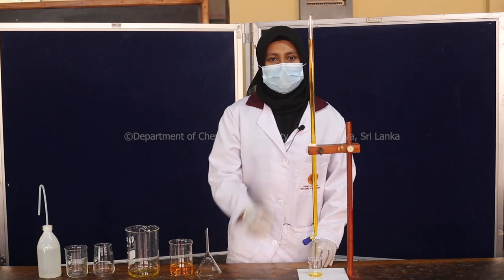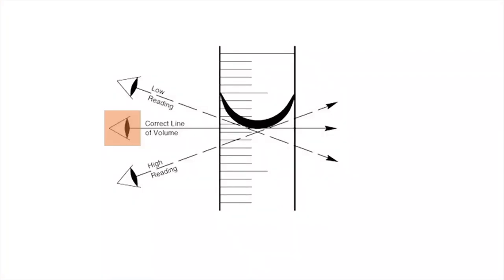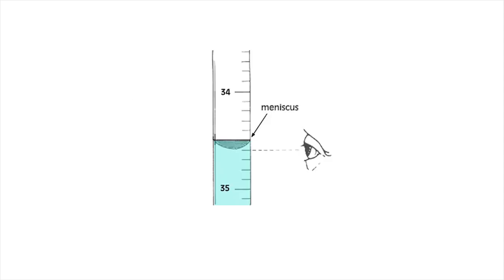Finally, make sure that there are no air bubbles inside the burette. When taking a reading using the burette, keep your eyes in line with the meniscus of the solution inside the burette. If the meniscus is aligned with the burette mark, take that value as the reading in two decimal places.